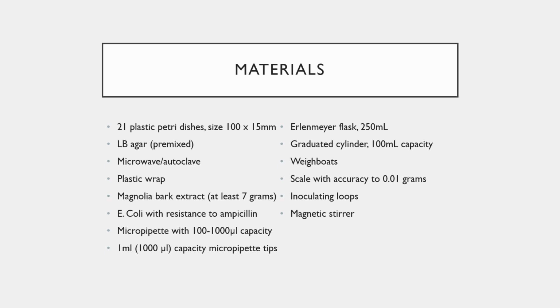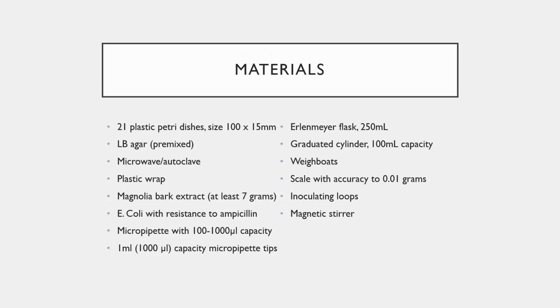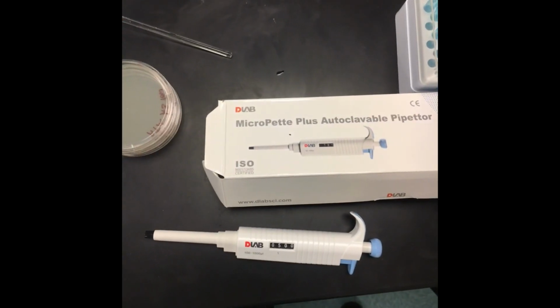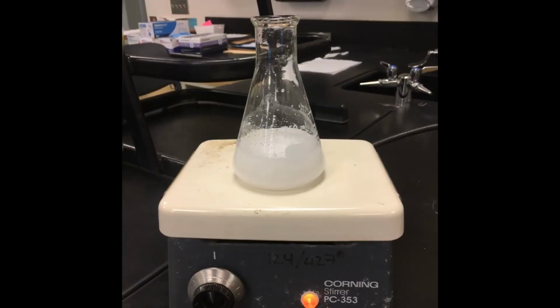The materials used are as follows: plastic petri dishes, LB agar, a microwave to mix that agar, and plastic wrap to assist with it as well, magnolia bark extract, E. coli with resistance to ampicillin, a micropipette with a large capacity, tips to use for that micropipette, Erlenmeyer flasks, graduated cylinders, and weigh boats, a scale with accuracy to 0.01 grams, inoculating loops, and a magnetic stir.